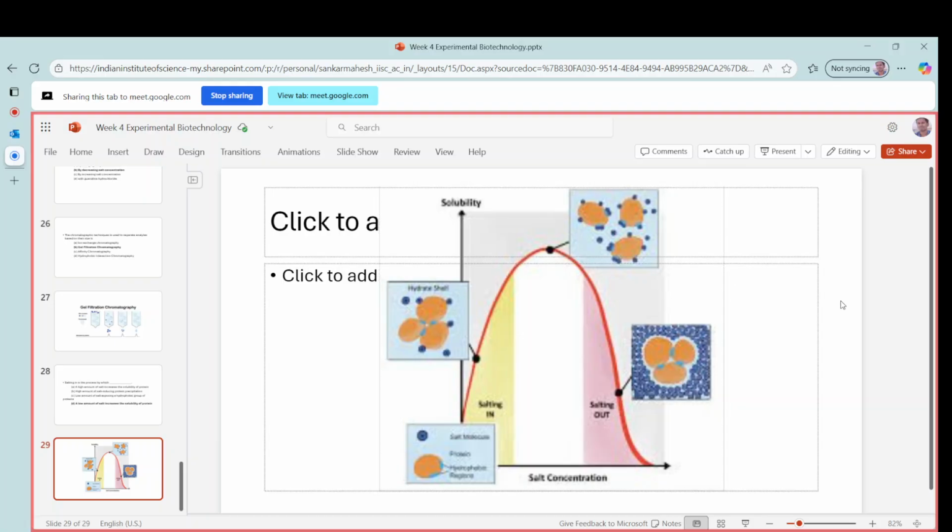So actually in labs we can purify proteins using this method as well. A very good salt that we use is ammonium sulfate because of the nature of the salt. There is a series that talks about the nature of salts and the nature of the ion in the salt, and both ammonium and sulfate followed by potassium is a good combination. So if you add that, that would precipitate your proteins. That is the salting out method. Whereas salting in is the ability to solubilize your protein.